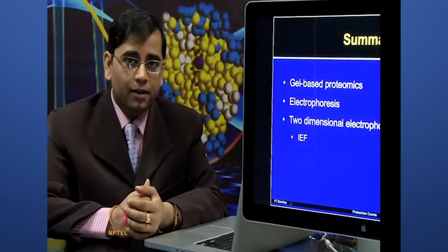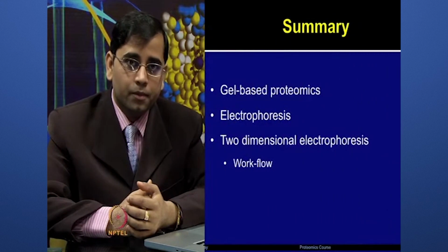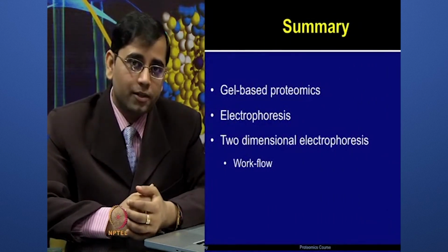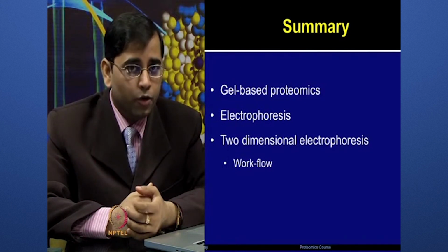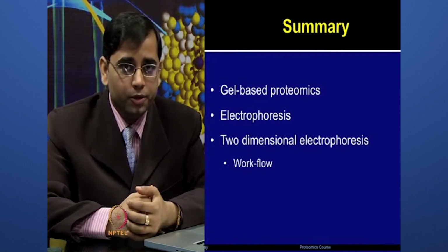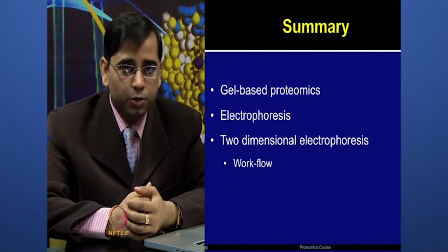So in summary, in today's lecture, we have discussed gel-based proteomics, different types of techniques being used in gel-based proteomic process. We have talked about different types of electrophoresis methods being used, including SDS PAGE and two-dimensional electrophoresis.